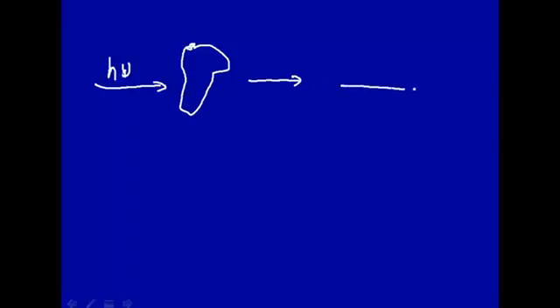And what we'll find, if we look at the spectrum, this is energy on this axis, is that we get the light at the same frequency coming in. Let's call this h nu 0. So this would be the light that just went right through the sample and didn't interact. But you'll have some lines on this side, and then the mirror image over here on this side.